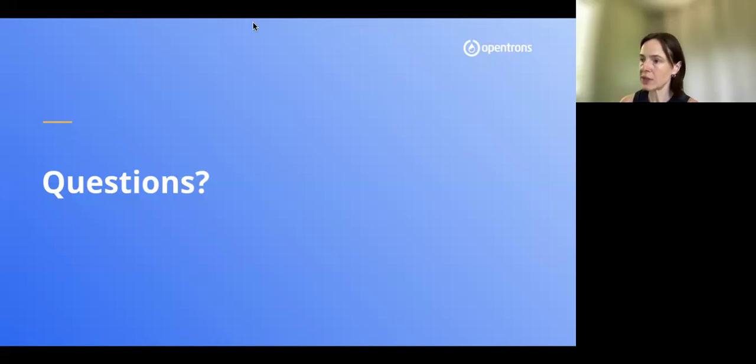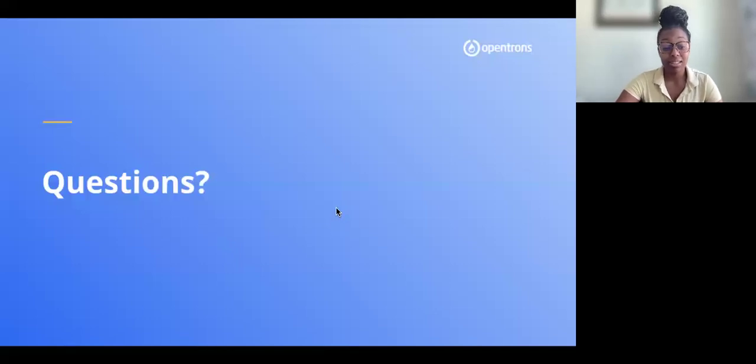Next question: you mentioned the enzymatic normalization. Could you outline the process from the library prep to the normalization? Is it a separate protocol? Do you have to change the deck layout? What does that end-to-end process look like? That's a great question. It depends, which is always an interesting way to answer, but it does depend on the enzymatic approach.